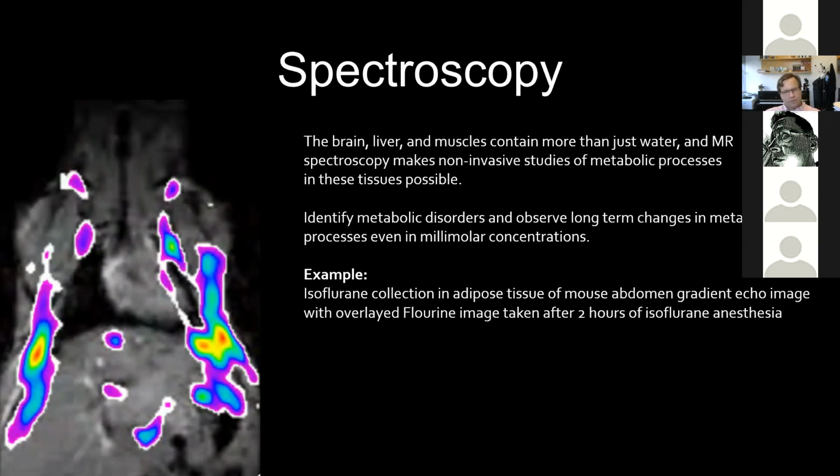And so NMR is used to perform some types of metabolomic studies. And it turns out that you can do metabolomics and look at specific metabolites in animals while they're still alive using high field MRI instruments like the one that we have upstairs. And so the range of molecules that one can image this way and detect is expanding rapidly over time, and there are some very interesting techniques and some great collaborating investigators here at Columbia who are helping us build out that set of molecules.